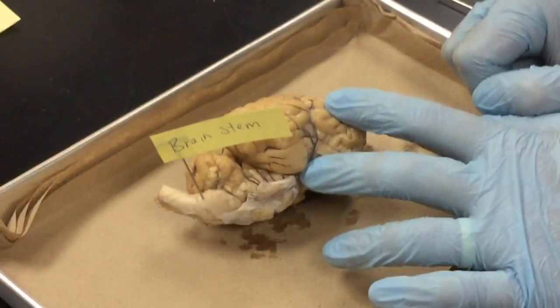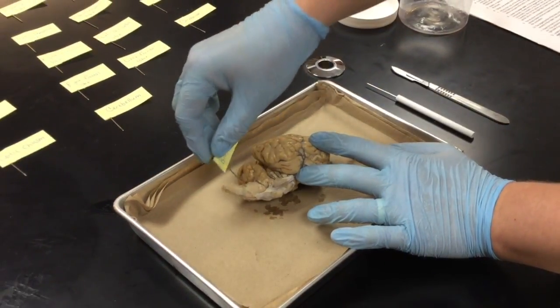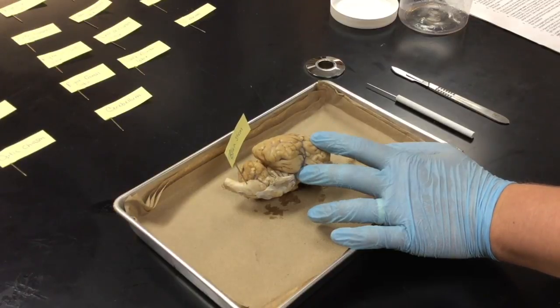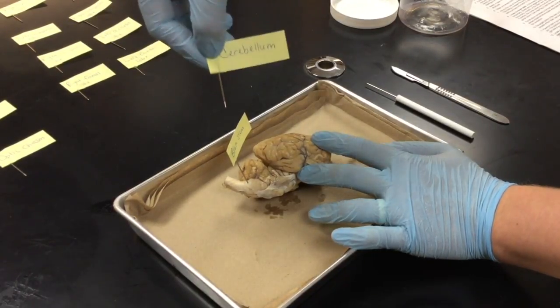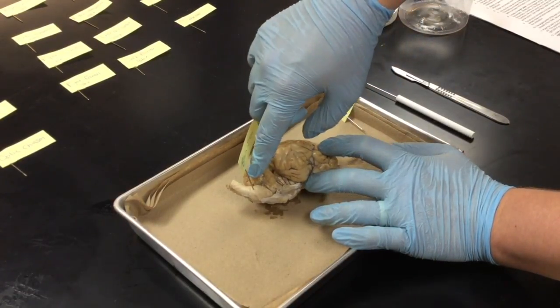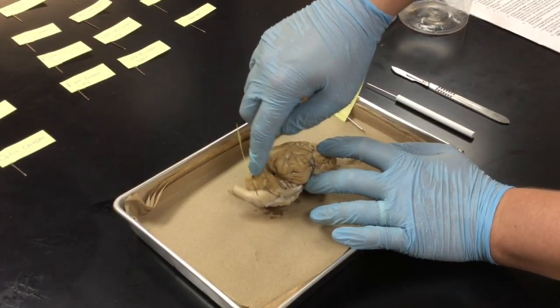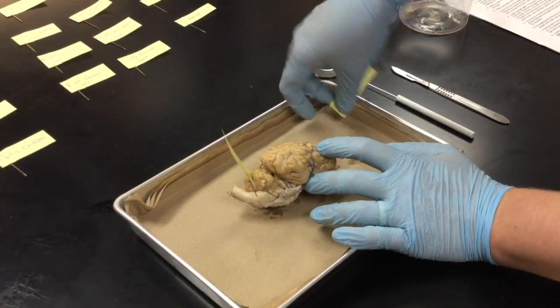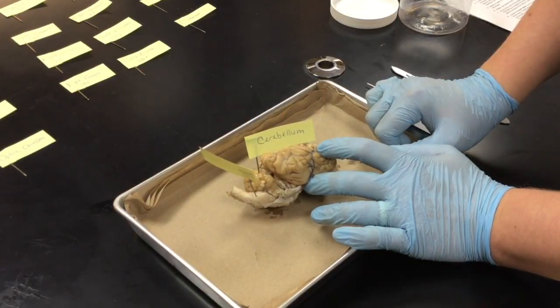The next structure that we want to be able to identify is called the cerebellum. Now the cerebellum, another name for the cerebellum is the tiny brain. So the cerebellum is going to be the region that's not connected to the main part of the brain, but it's going to be posterior and dorsal, so to the back. So we just place the cerebellum flag in like so.